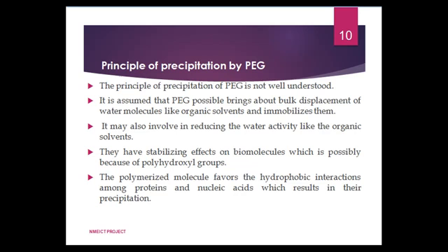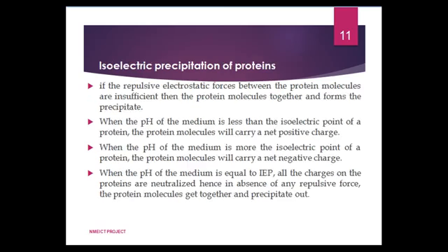They have a stabilizing effect on biomolecules, which is possibly because of polyhydroxyl groups. The polymerized molecules favor the hydrophobic interactions among proteins and nucleic acids, which results in their precipitation. Another method is the isoelectric precipitation of protein.